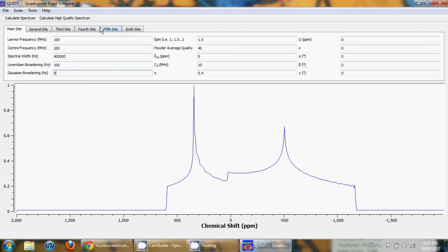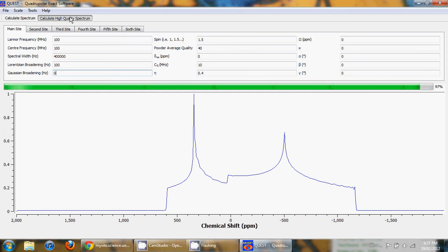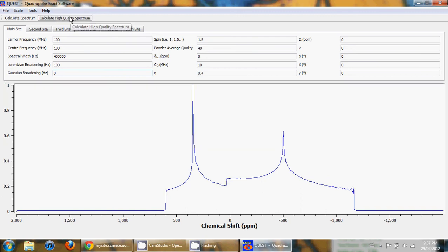But if you want to create a figure or get somewhat higher resolution, you can click the high quality spectrum button and this will generate a spectrum with 2000 data points, a slightly higher quality spectrum which is good for making figures.